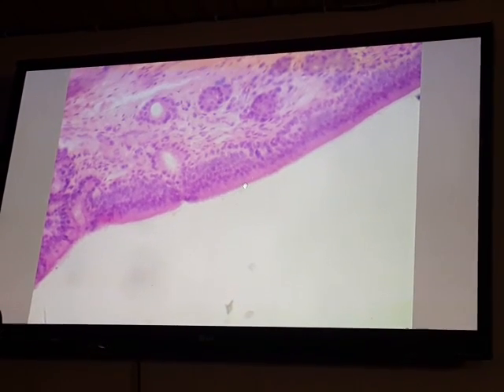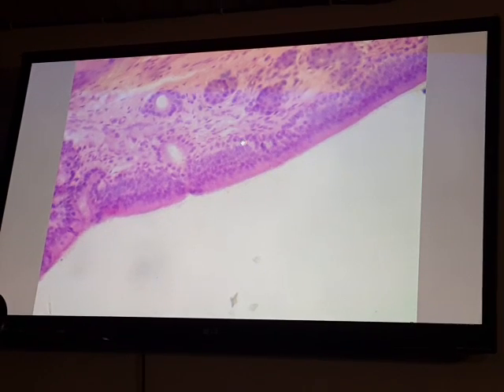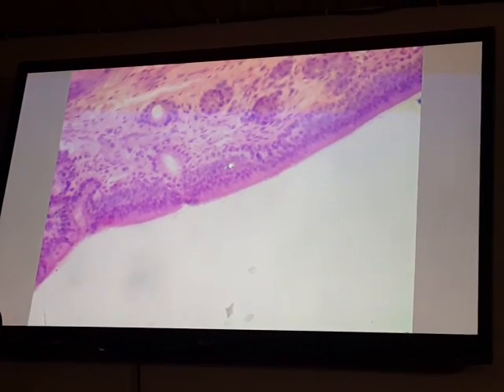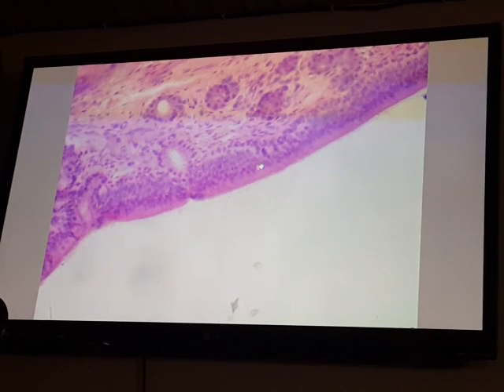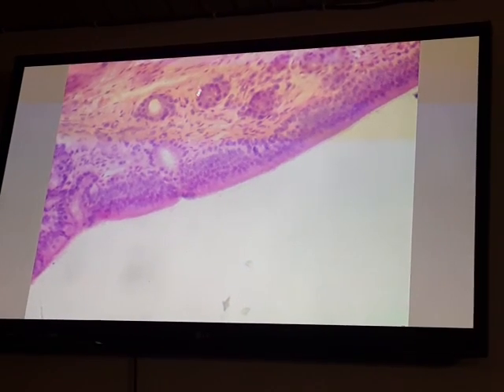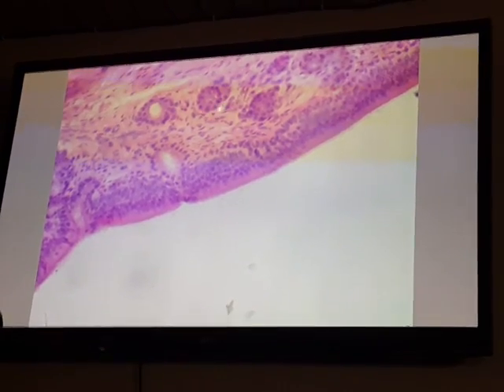What is required for the olfactory epithelium: you should know the type is pseudostratified columnar epithelium. Three types of cells: at the base are basal cells, in the middle olfactory cells, and near the surface are supporting cells. In the lamina propria we have Bowman's glands that produce a fluid environment around the cilia.